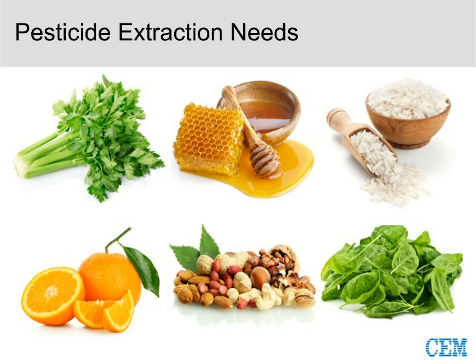So with that, I really hope you've seen now this visual of the EDGE and how it works. So let's go back to the application. We talked about how many pesticides, over 900, that we have to be concerned about.